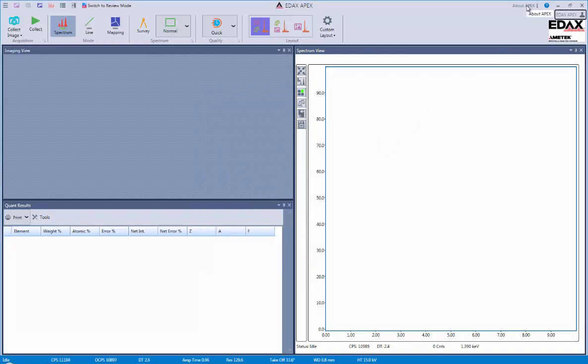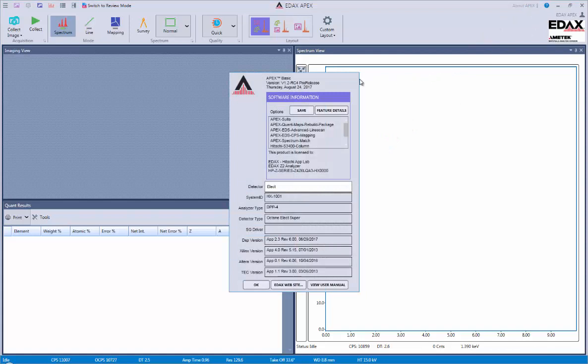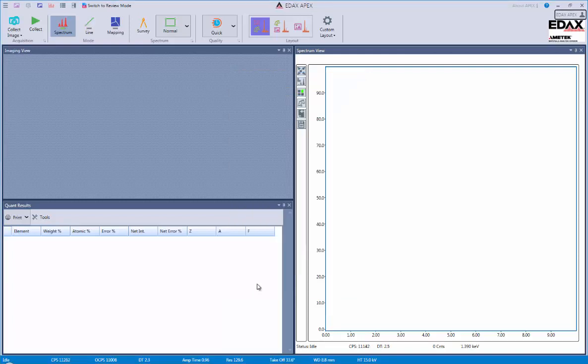We also have an about area, which provides some useful technical support information as well as showing the user manual. Next, we have our top activity bar.